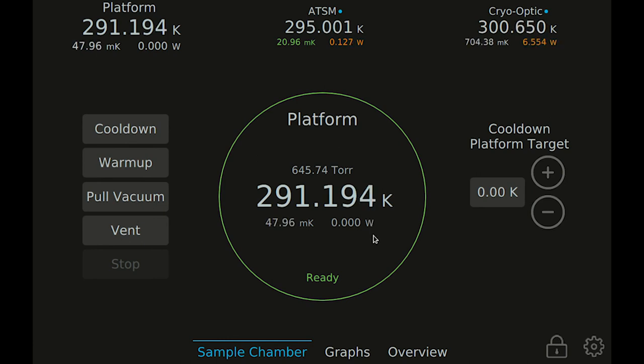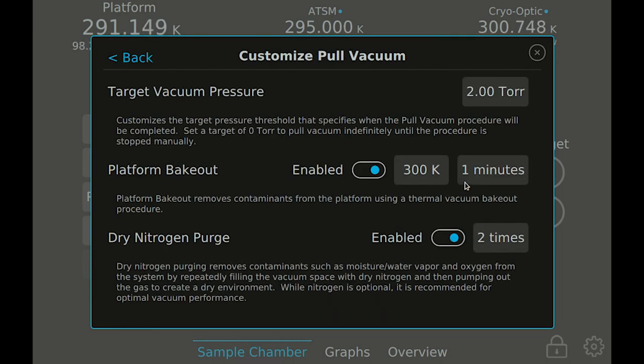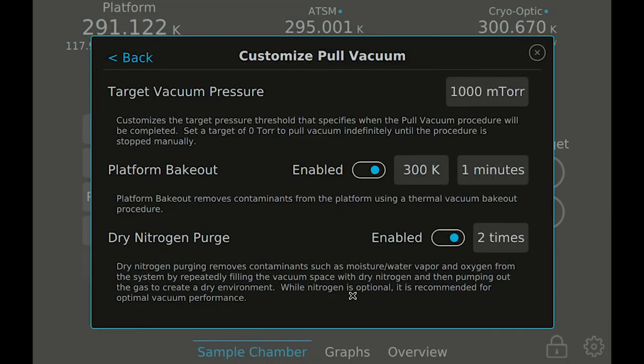If you won't be using the system immediately to do another cool-down, it is recommended to use the pull vacuum button to bring your sample chamber back under vacuum for storage. This will help keep water vapor and contaminants out of your system, helping ensure an efficient, effective cool-down the next time you use your system. The pull vacuum procedure uses the same options as your last cool-down. Set a target pressure to pump down to before turning off the vacuum pump and valving off the sample chamber. If you set a lower target pressure than the roughing pump is capable of achieving, then the pull vacuum process will run indefinitely until stopped manually. This can be useful for using your sample chamber as a sample storage area when not in use.